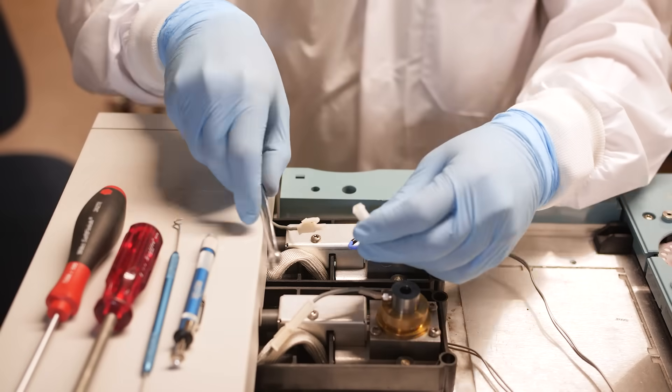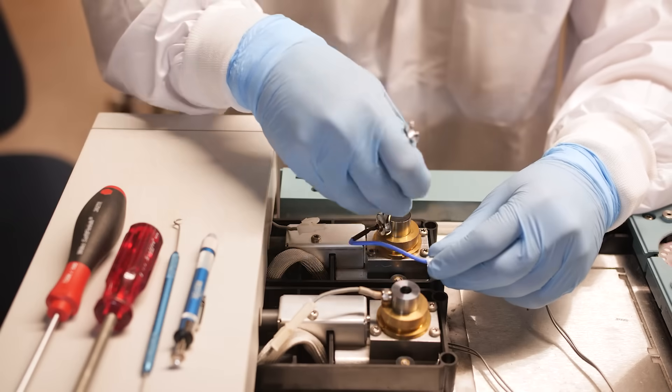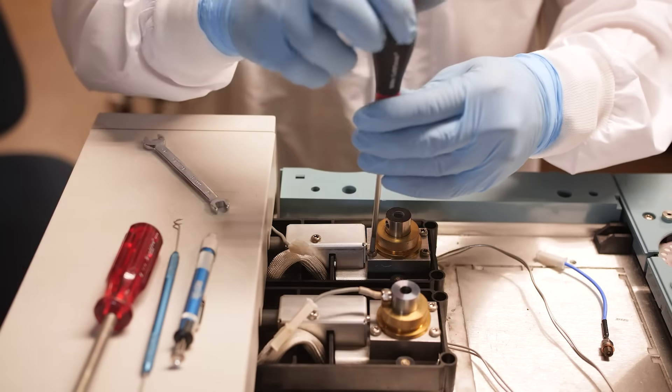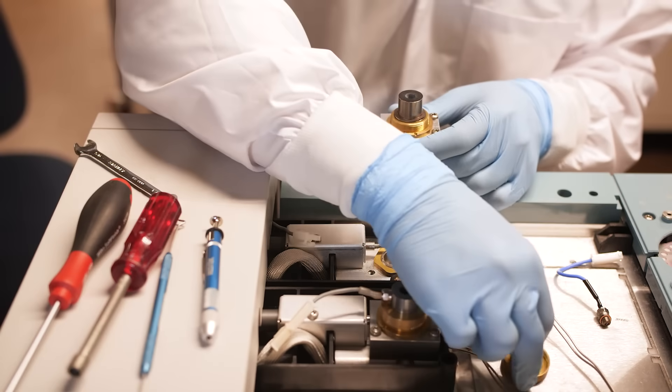Next, we'll start to disassemble the FID. Remove the igniter and all torque screws from the FID body. Then, remove the knurled brass retaining nut and spring washer.